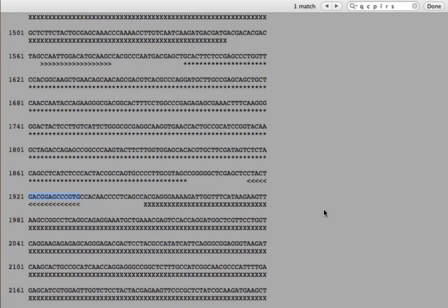And so what do I mean by that? Well, this is the 5' end right here of this area on the complementary strand. And notice the sequence is G, T, G, and then C, C, C. C, actually there's 4. Well, let's keep that in your mind really for a second. G, T, G, C, C, C, C.